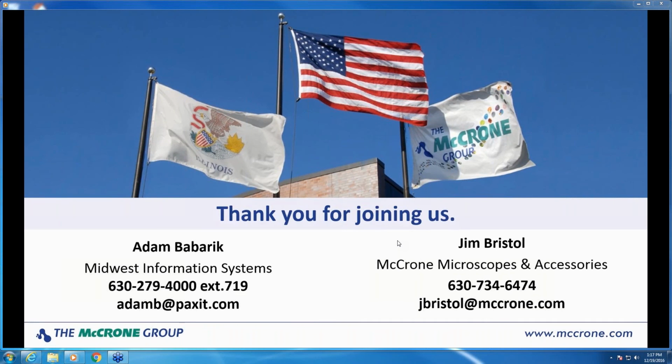Okay, great. Another question from Chris. Do you offer IQ services, installation, training, things of that nature? Yes, Chuck, we do. MIS provides a full IQ service package with documentation for the extended security installations.